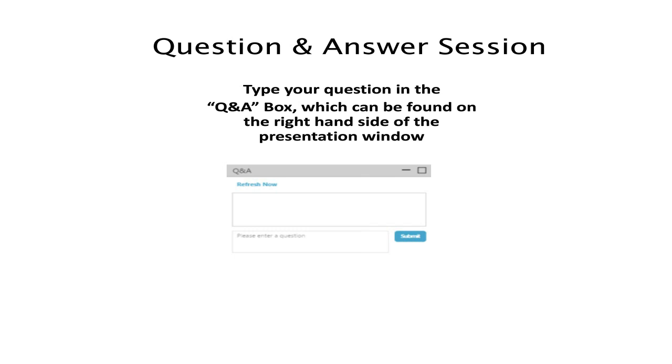And a robotic line is really a kind of a difficulty because typically you don't have any glove entries inside, and that's why you need to have built in a robotic way of exchanging air sampling methodologies. In this respect, it might be a chance to use a robotic arm to exchange the BioCapt. We've done some studies and we are looking into that together with robotic manufacturers in the filling line environment.